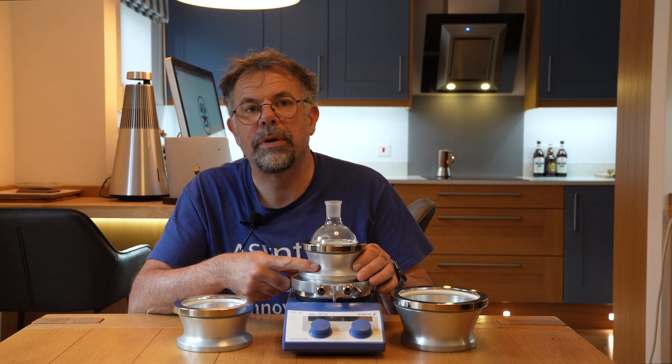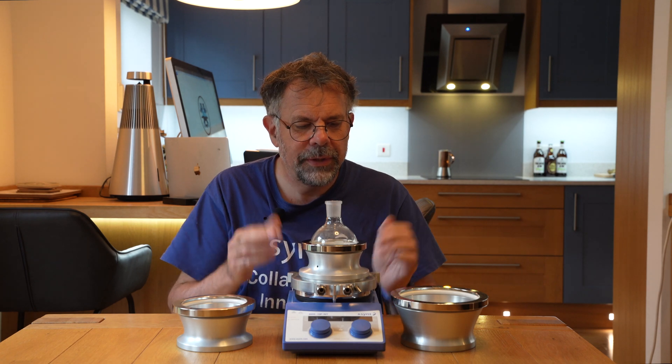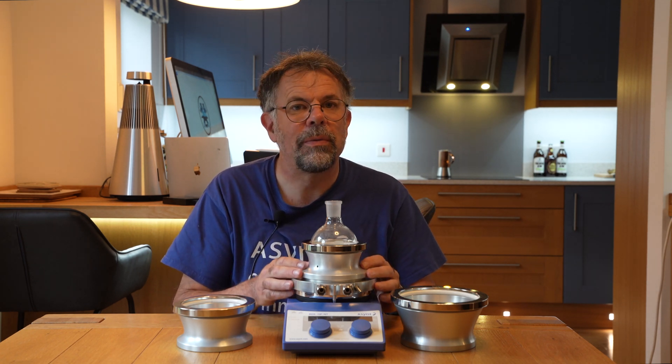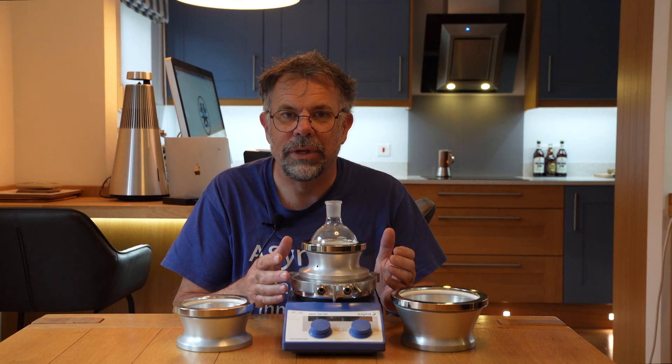There is a temperature probe socket here, so you can put in a PT100 to control the block temperature precisely from a thermoregulating circulator. This really comes into its own for overnight experiments where you may want to keep an absolutely constant temperature — maybe even room temperature, say 20 degrees centigrade. You can precisely control that, and exothermic reactions can be controlled easily.